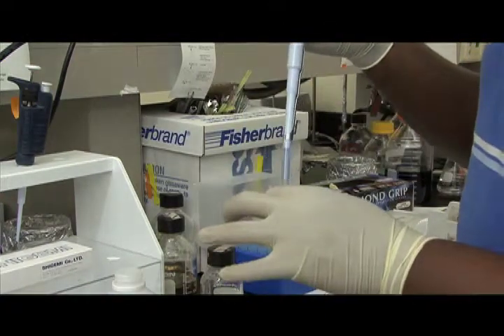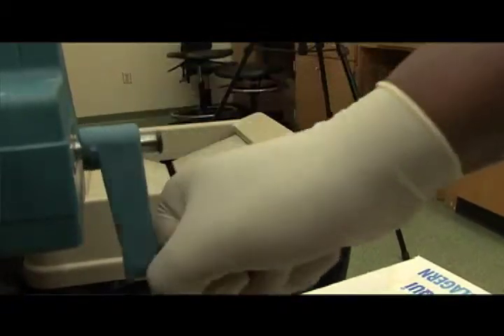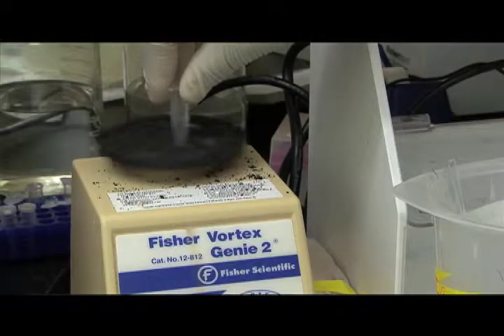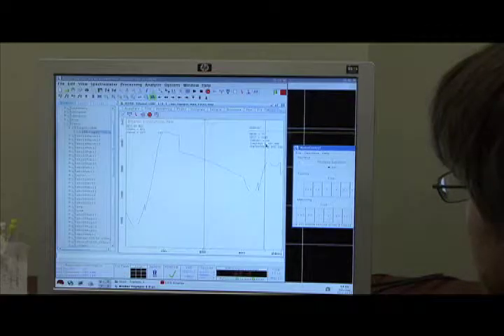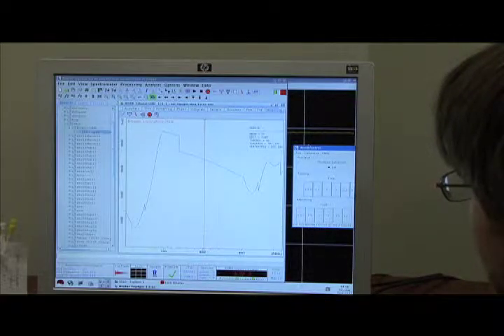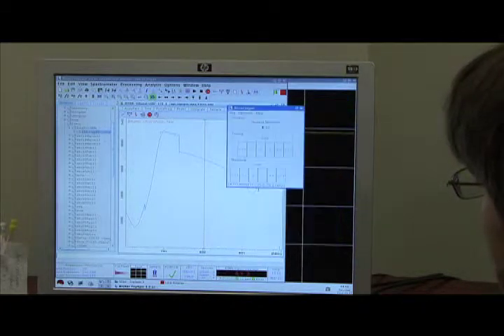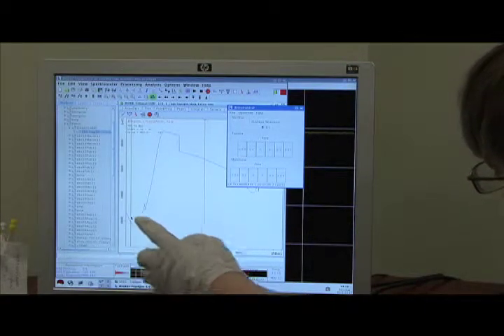I like to make an analogy with a guitar or piano. And the way we pluck the strings, so to speak, is we fire in bursts of radio frequency light. So the resonance of the nuclei in the magnetic field, and when I say nuclei, I mean the inside middle parts of atoms, okay? All atoms have these nuclei. And so these nuclei resonate in radio frequencies which are just below your FM range and just above your FM range and also just below your cell phone range.